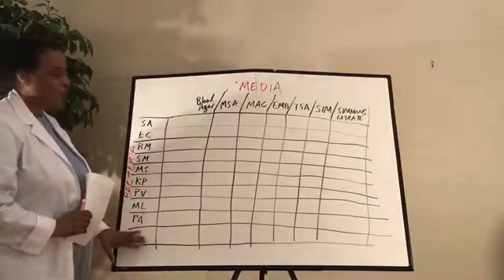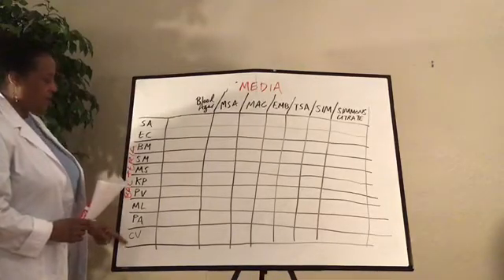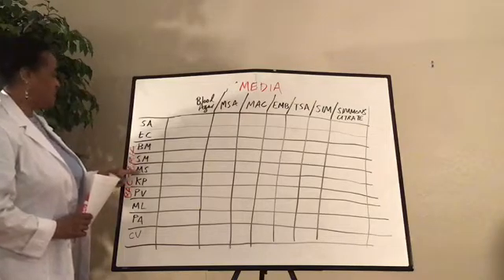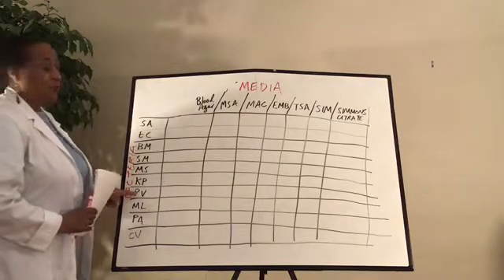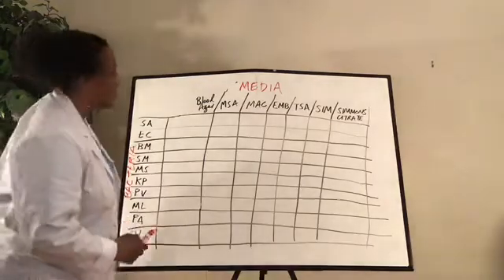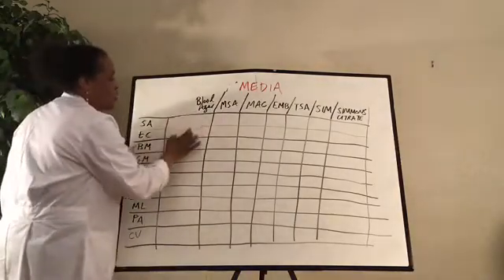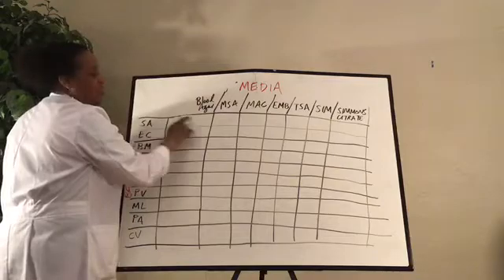Along this y-axis, we have bacteria. All 10 of the bacteria are labeled here. Staph aureus, E. coli, Bacillus megaterium, Serratia marcescens, Mycobacterium smegmatis, Klebsiella pneumoniae, Proteus vulgaris, Micrococcus luteus, Pseudomonas aeruginosa, and Chromobacterium violaceum. All of those are labeled here. You can number them. That would be fine too. But my space is confined, so I don't want you to have these little narrow windows to write in, because you have to put, for blood agar, does Staph aureus grow on blood agar?